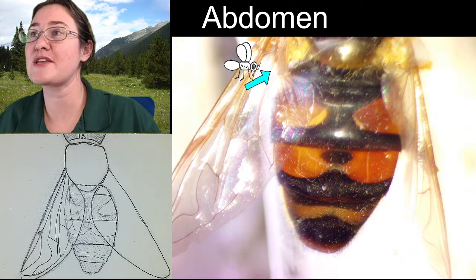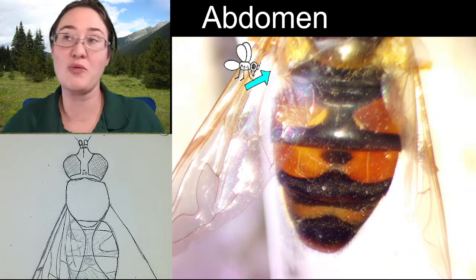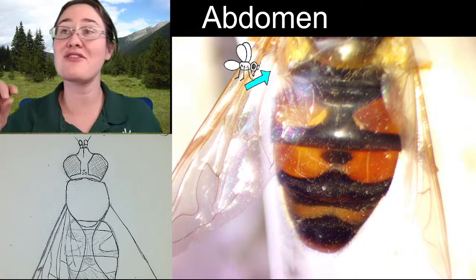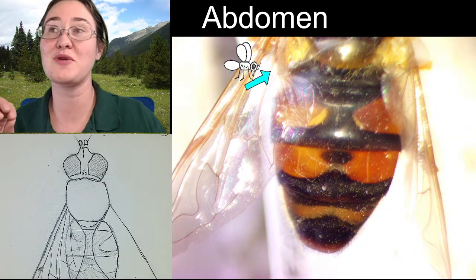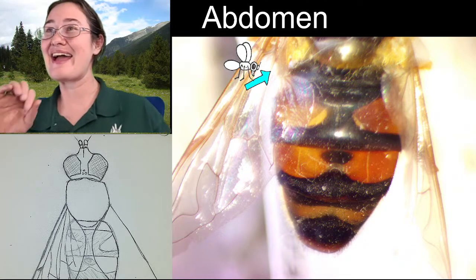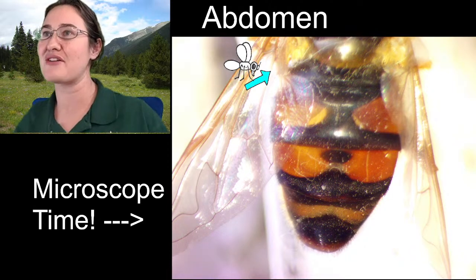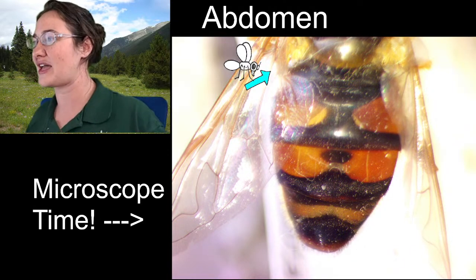Let's turn the specimen a little bit. There's a part of me that really, really wants to add the legs, and there's another part of me that really, really wants to save my voice. So, we're gonna turn off my sketch really quick, and we're just gonna look around at the specimen and see what the legs look like.